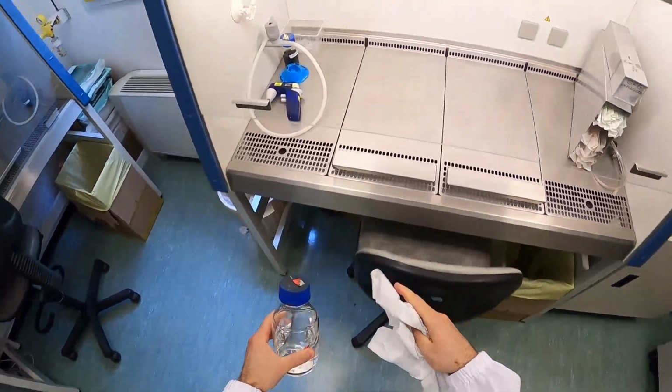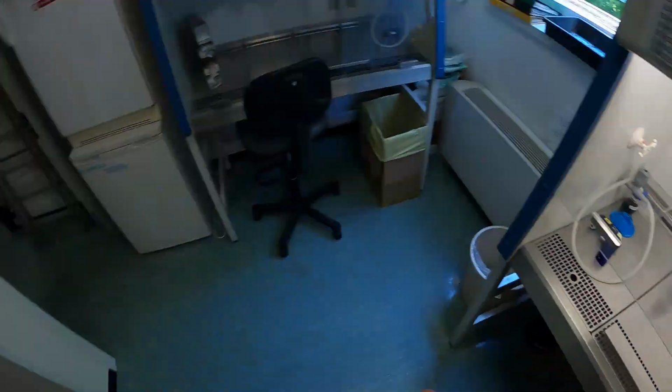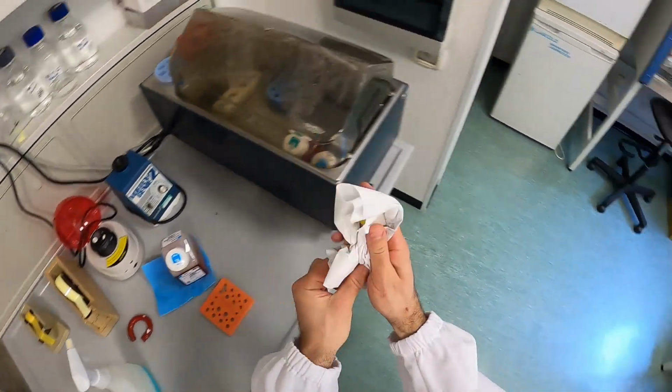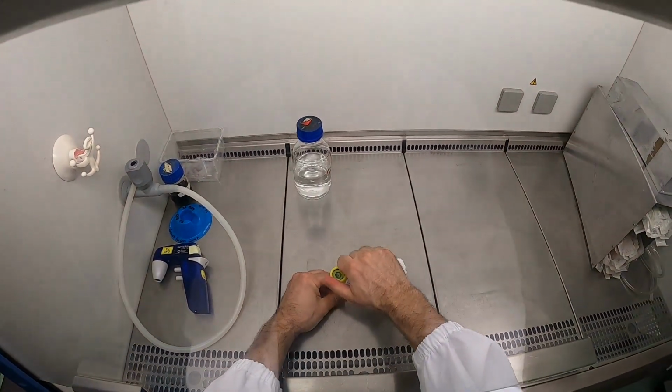Wipe them down with ethanol before taking them into the hood, and then open the cap a little bit just to make it easier for you to handle the bottle or the tube later on when you're holding several things at the same time.